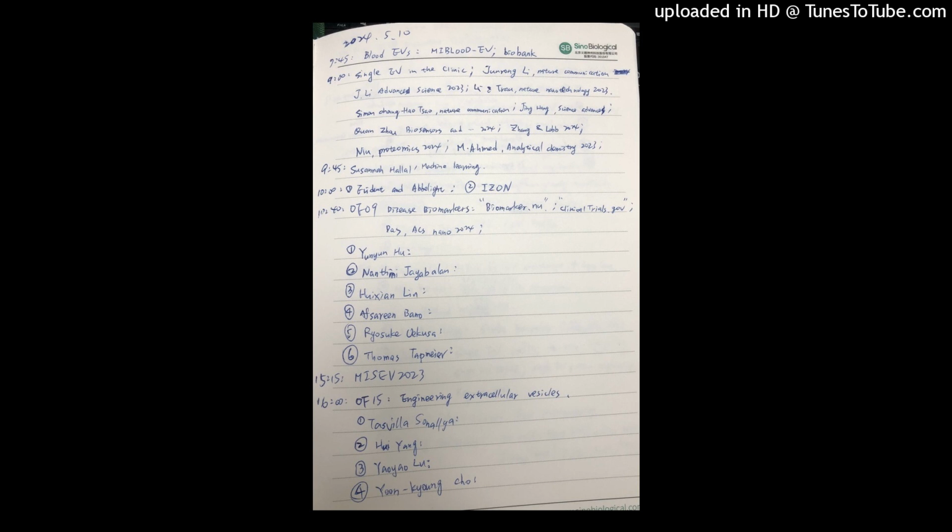In this assay, the EV will be labeled with the antibody-DNA conjugate first, and the protein information will be transformed to DNA, and the DNA will trigger the triplex ddPCR for the EV subset analysis at the single EV level. In this way, the EV could be divided into roughly 8 clusters based on 3 kinds of protein biomarkers. Here are some main results.